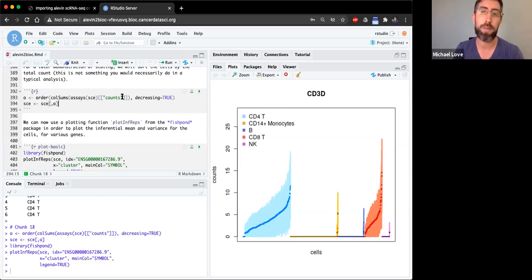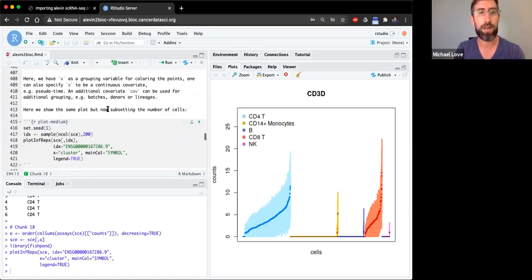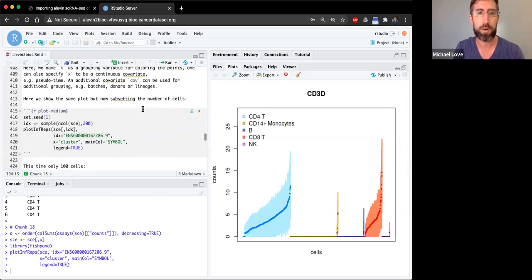I'm looking at the time, so I know that I probably won't be able to get through all of the workshop today. The point is just to give you a taste, and you can look at it on your own. But I do want to show you one thing, which is the scaling, and then I'll jump to the end to show you taking this data set out and then using it with Seurat, for example. So I might skip this.